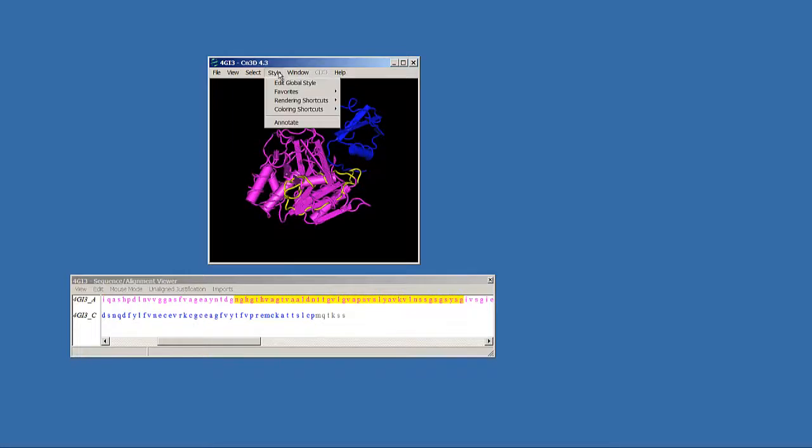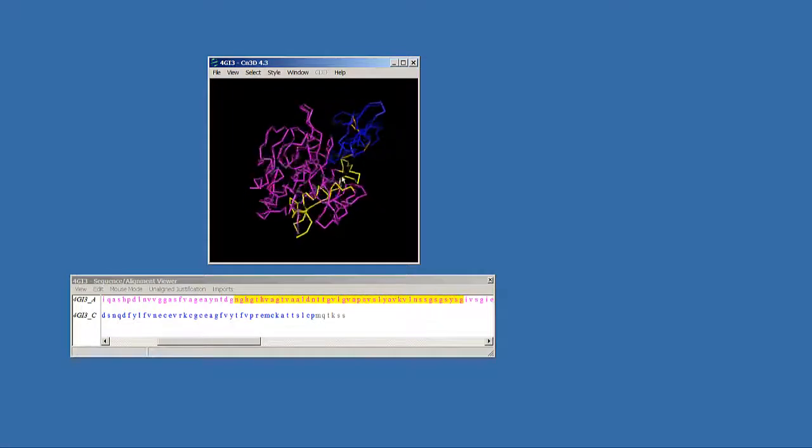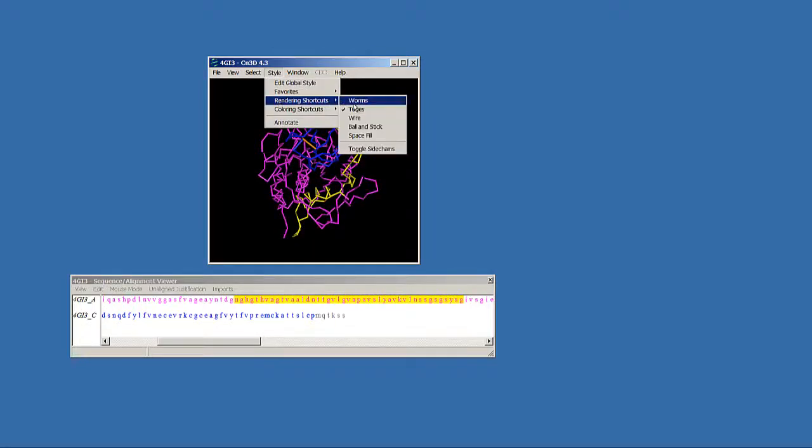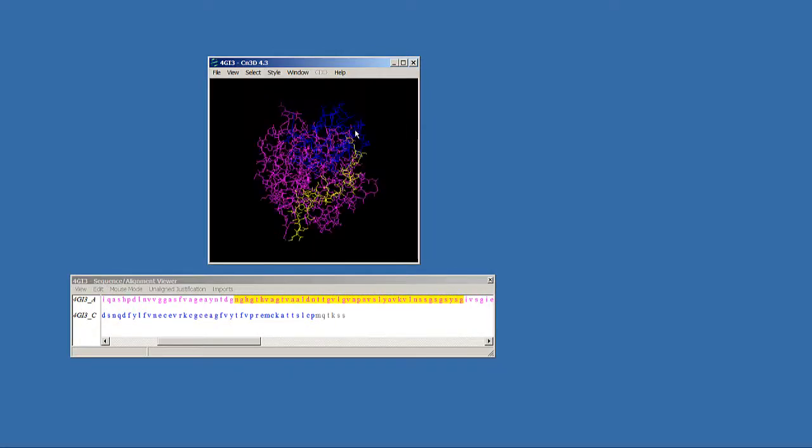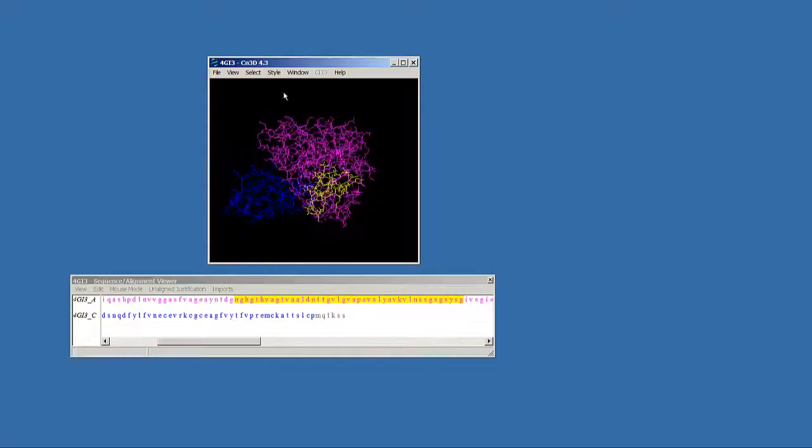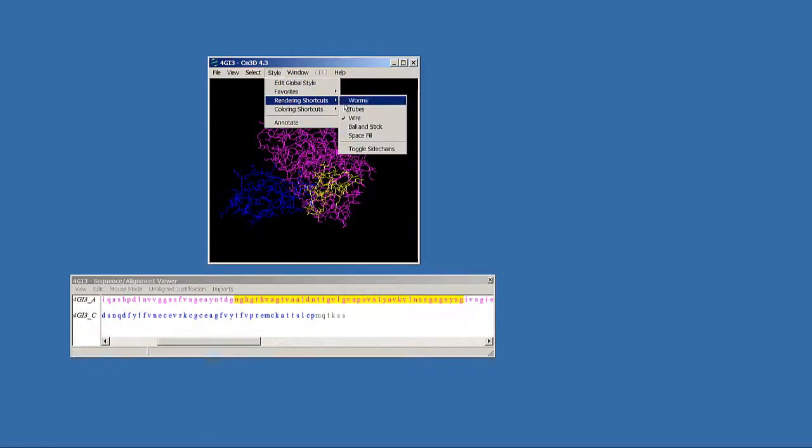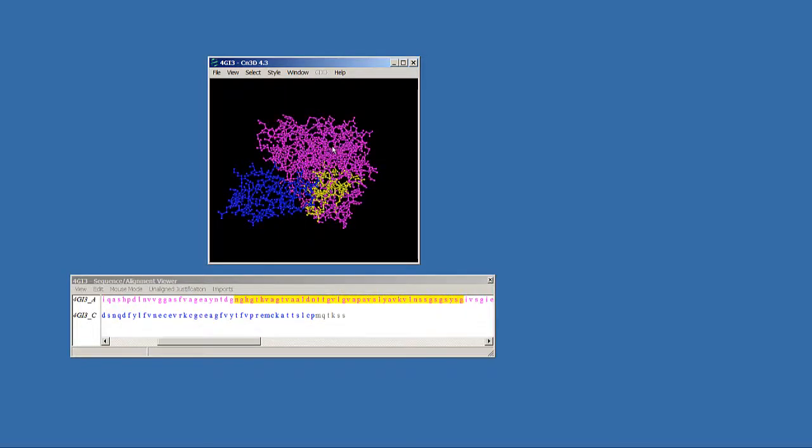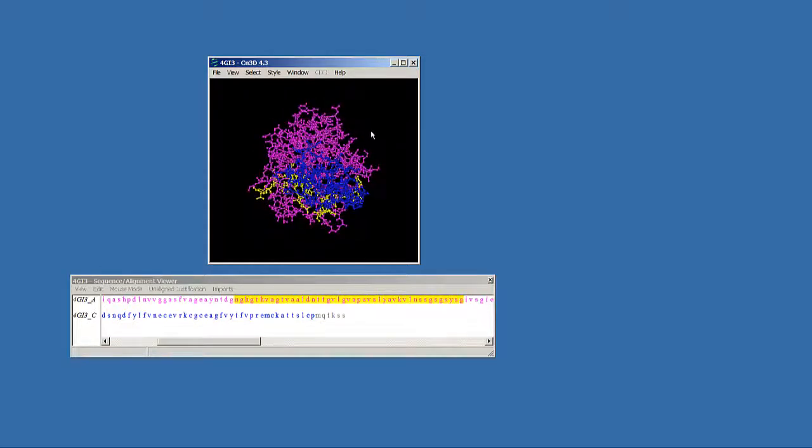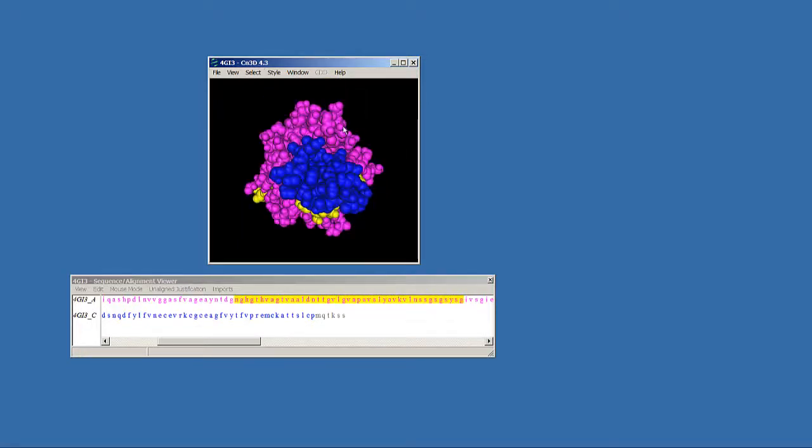You can look at different views of this molecule: tubes, wire, a ball and stick model, or the space-filled model.